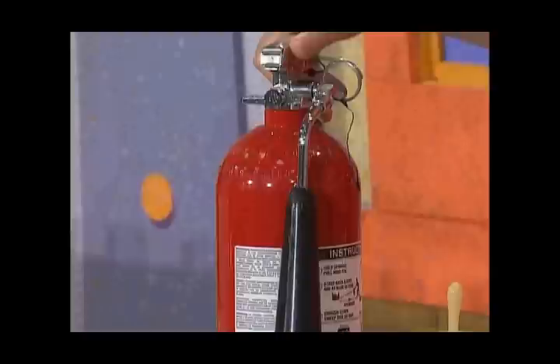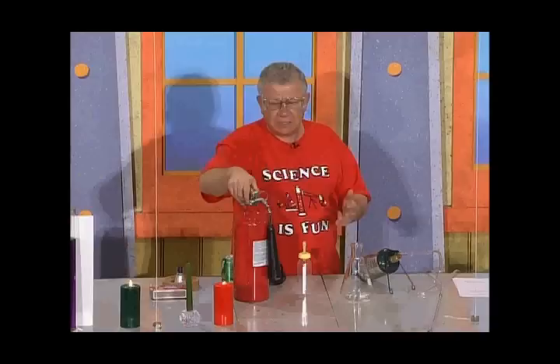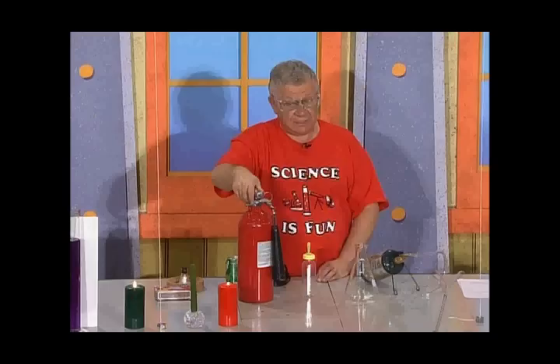In my lab, we always obey the safety rules, so I'm going to put my goggles on as I do the experiments. We have a fire extinguisher right here, ready to be used just in case something goes out of control. We're not planning on anything going out of control, but it's ready as a safety precaution, and it is part of the safety regulations. I'm going to put it on the side here where I can reach for it if it is needed.